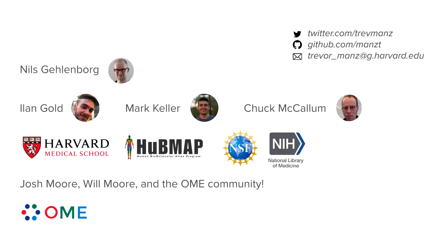Thank you. These were really great talks. Very exciting technology. So how big so far is this repository of imaging data? I can imagine that for biologists, it would be really useful to access a bank of control images, for example, whether it's mice, non-human primates, or humans. That would save us so much time and money in continuously sacrificing these animals and restaining controls for every single experiment. So how far away are we from making that a useful repository?